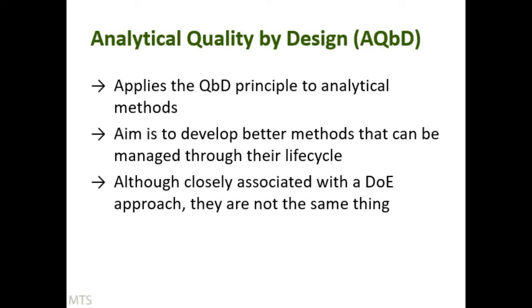Something that you'll find if you look in the literature is that pretty much always, when I can find QbD and HPLC, it talks about DOE. So it's very closely associated. DOE does work very well for giving you quality by design methods, but it's important to realize they're not the same thing. It is possible to create quality by design methods with computer modelling, even with one factor at a time, with good understanding of what you're doing, and not use DOE, but still have QbD.